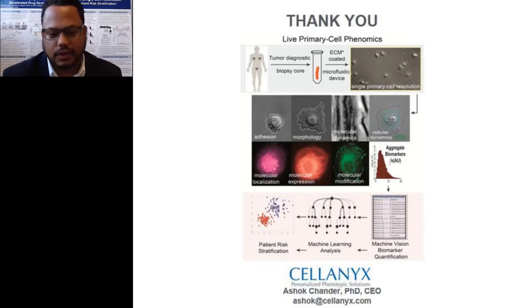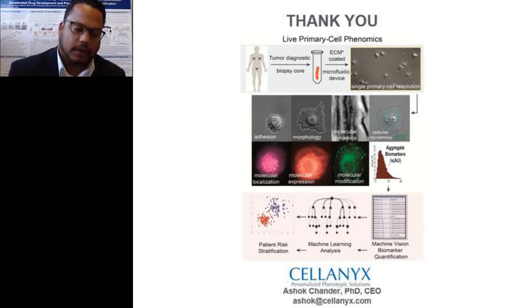Yes, the key features, I think, are, one, of course, the ability to rapidly keep cells alive, and not just on the device or on top of the microscope, but in transport. And then, of course, the ability to have a good suite of biomarkers that are of interest to whatever general area or indication one is interested in. And then three, of course, the machine vision that we talked about towards objectively quantifying the biomarkers.